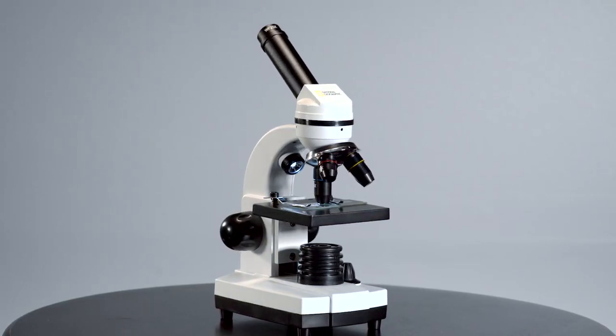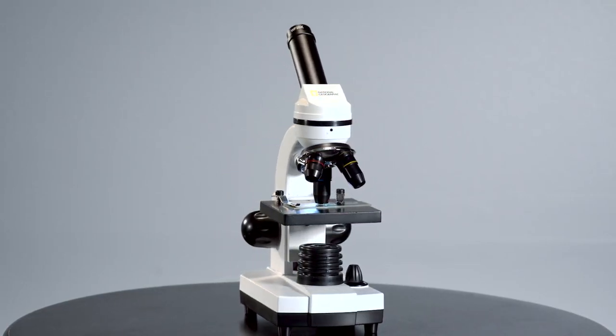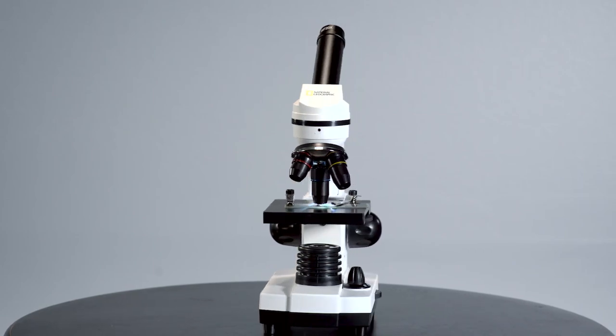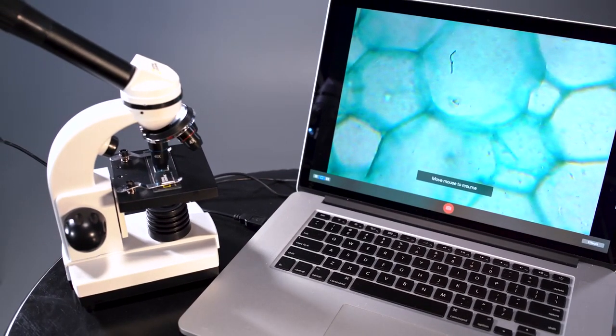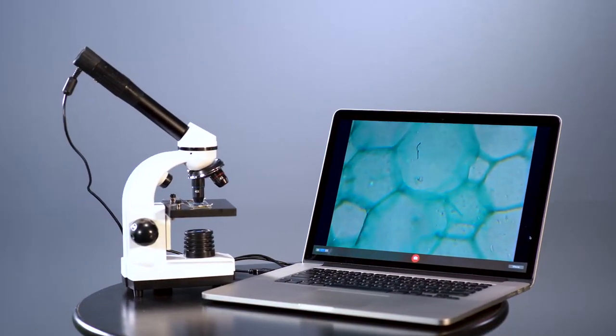National Geographic's 40-1600x microscope adds a digital twist to its traditional design with the inclusion of a USB eyepiece that connects directly to your computer, allowing easy viewing, sharing, and image capture.